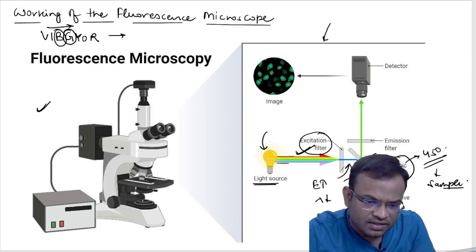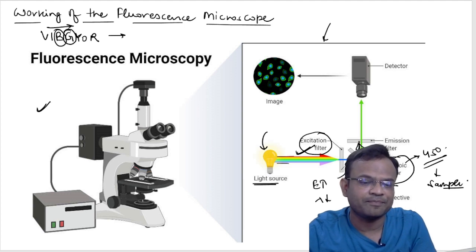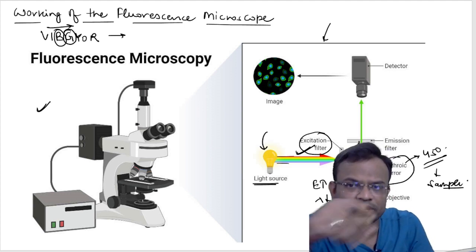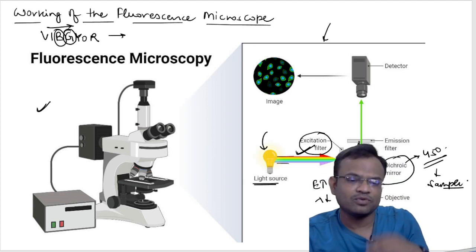You can see that the light is just passing through this. It is not getting reflected just like the previous light or the incident light. This is the function of dichroic mirror. Dichroic means two colored. Chroic, chrome means colored. Okay, I believe you would have understood.